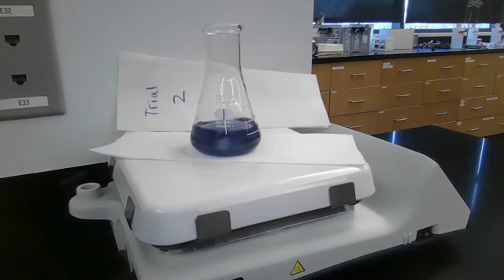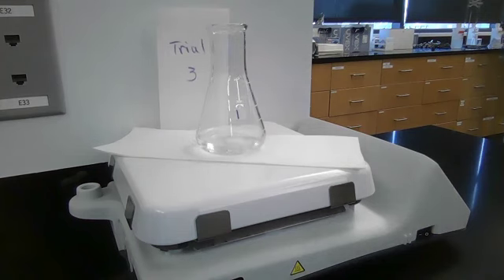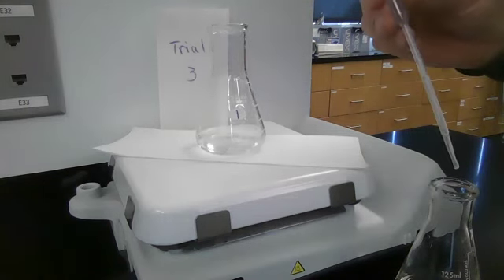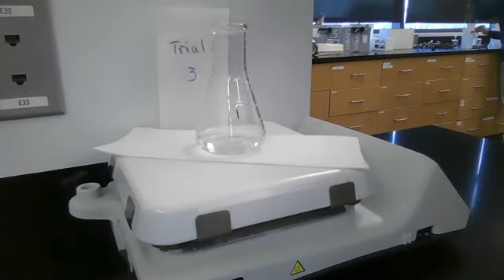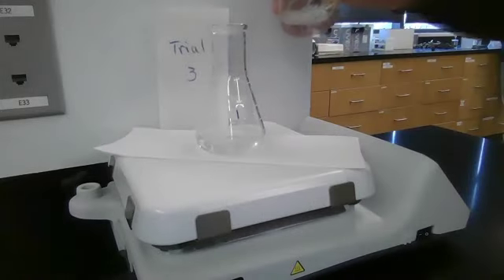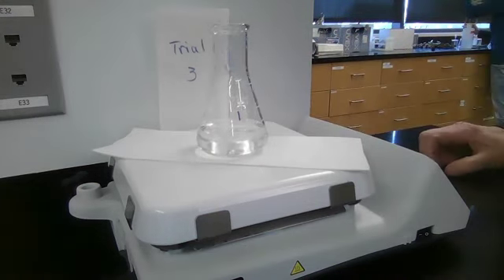All right. Ready for trial 3. It's all set. Dr. Kuhn says we should do trial 3. Trial 3, flask 2. We're going to go with 7 drops. Pretty good. I think I did 8 last time. Okay, mixing up the medicine. Get ready to time trial 3. Here we go. Not sure how long this one takes. On your mark, get set, go. It does make a little more. Spin it up faster.